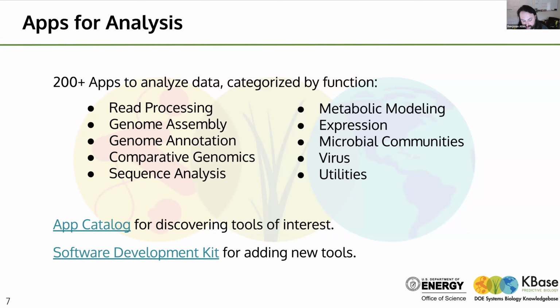So, instead of putting them just into a GitHub and hoping people will come and find them and figure out how to install the tools and all of the dependencies and all of these things, the platform enables those developers to situate their tools in a way that makes them easier to use and more accessible, in addition to driving them with our high performance computing power.